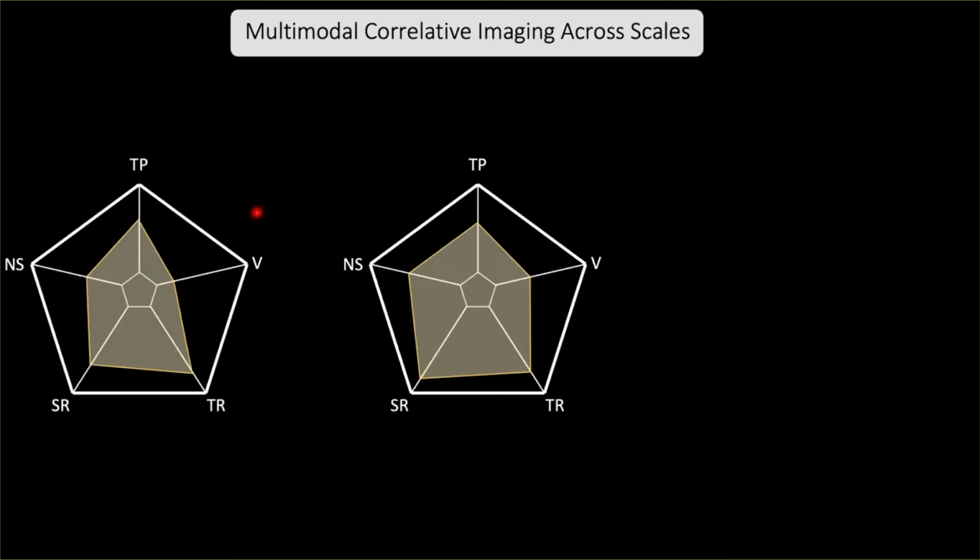So let's try to put it on the axis, and my apologies if there are slight inaccuracies. I would not try to sell this as a perfectly objective process, but I would say that temporal resolution is more or less comparable between these approaches. Maybe because of the two-dimensionality, one could argue the spatial resolution is a little bit less. One could also argue that it's a little bit more, because we now can use fluorescence microscopy paradigms that give better spatial resolution, like super resolution, STORM, etc.